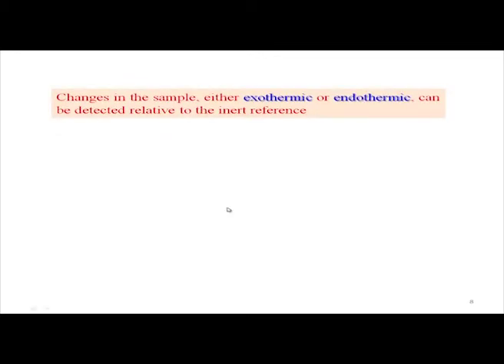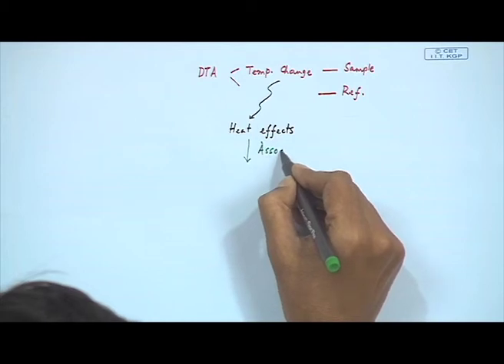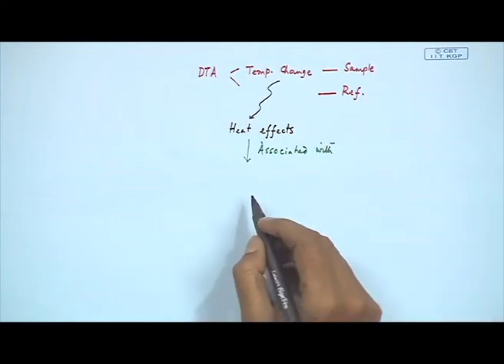So, we get these two things, that means the heat effects, these basic heat effects, and these heat effects are basically associated with several chemical and physical changes.